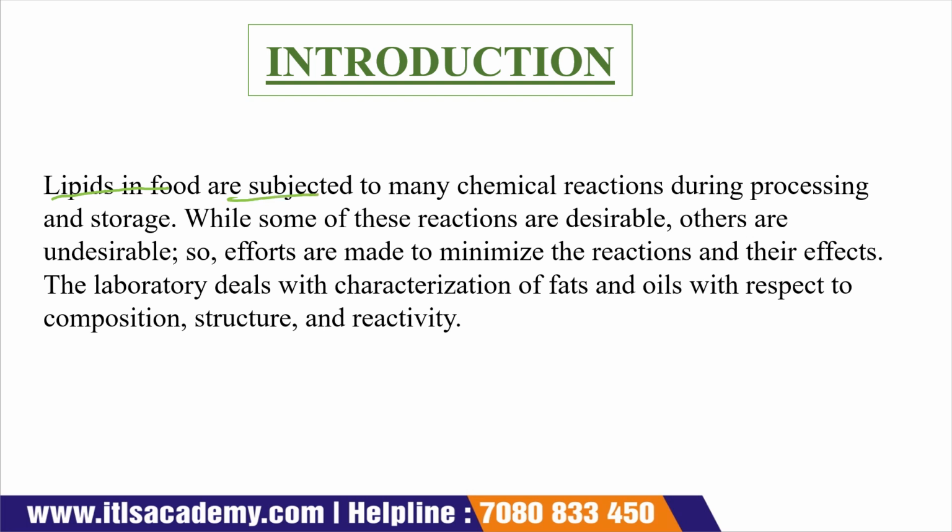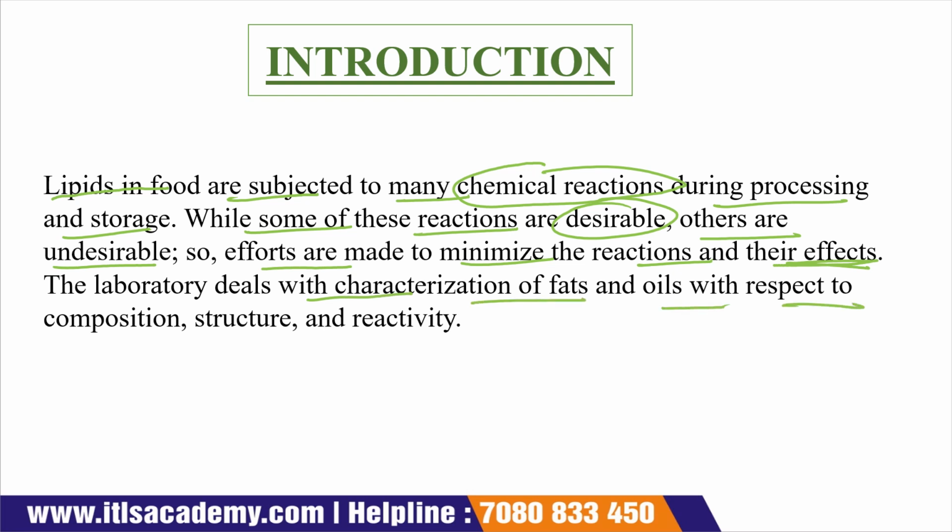Lipids in food are subjected to many chemical reactions during processing and storage. While some of these reactions are desirable, meaning we require them, others are undesirable, meaning they are not required. So efforts are made to minimize those reactions and their effect. The laboratory deals with the characterization of fat and oil with respect to composition, structure and reactivity.